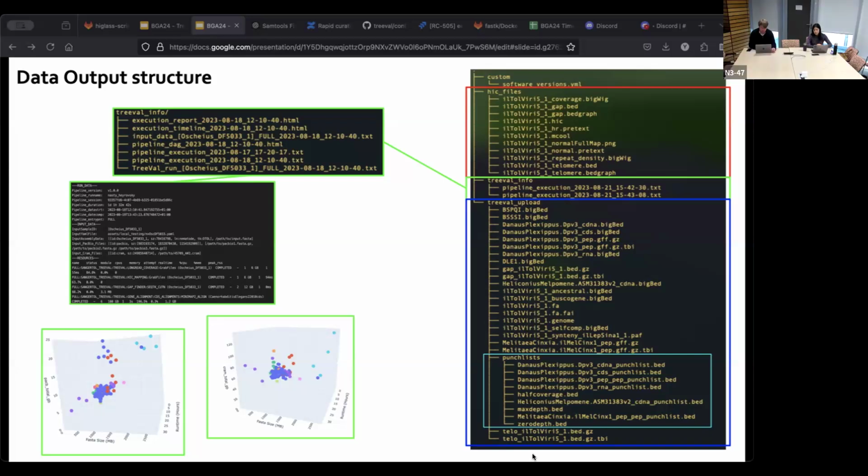Very good question. So recently, we changed our strategy. The ideal world is we work on a single haplotype genome, but the real world isn't that simple. So what you see is the two haplotypes together, because they want to see the behavior of our upstream purging, if that worked.